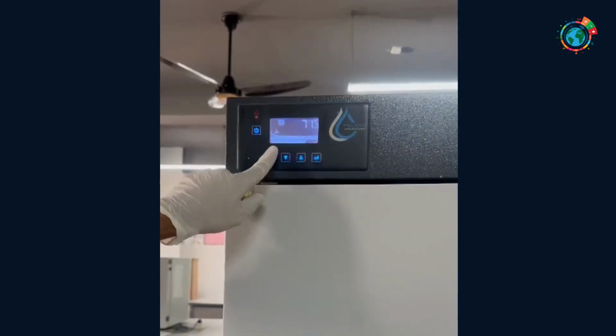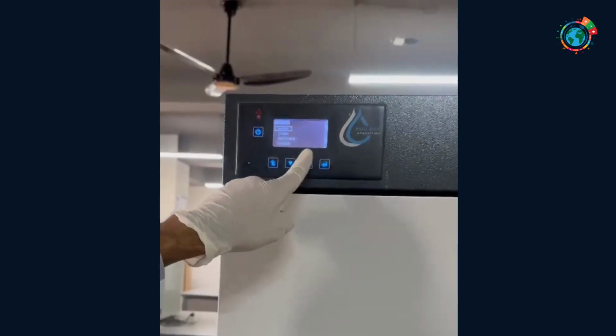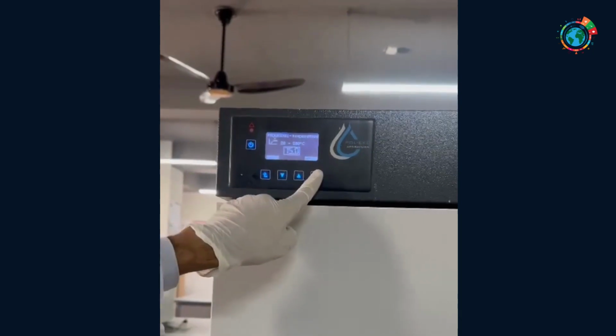After placing the empty China dish in a hot air oven, its temperature is adjusted using a digital interface or touch panel that allows users to select and adjust the desired temperature.